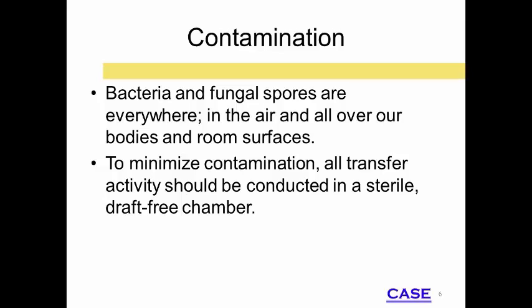Although surfaces appear clean, contaminants are everywhere on every surface. Bacterial and fungal spores can persist in the air and even the plant tissue intended to be cultured. The goal of sterilization is to destroy all contaminants. This is very difficult to accomplish, and at best we can hope to minimize the risk.